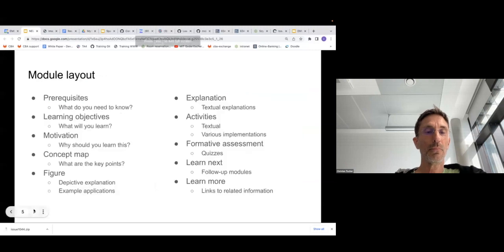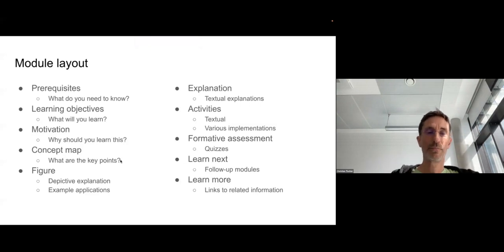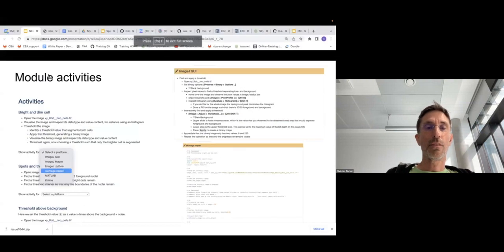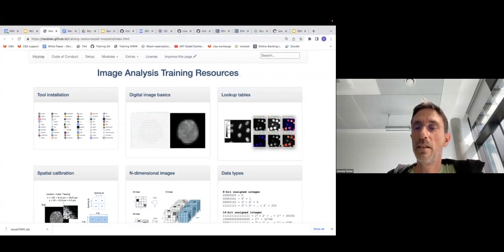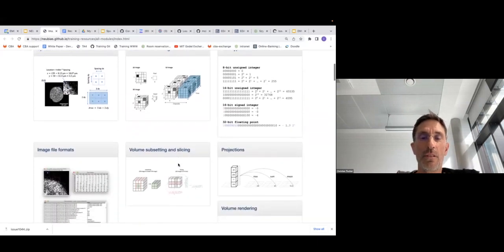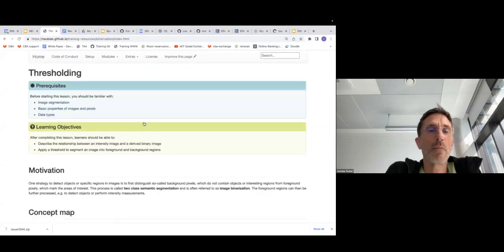Then each module has different sections. And I think I will simply go to one of these modules and just show you live. So, for example, the thresholding module. So now let's say you want to teach this, okay, as a teacher.